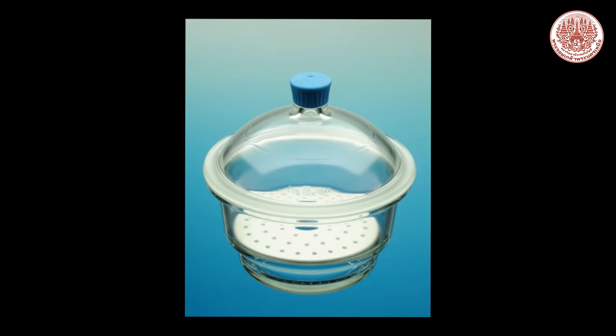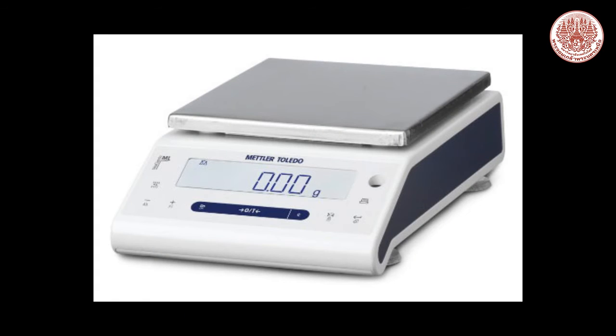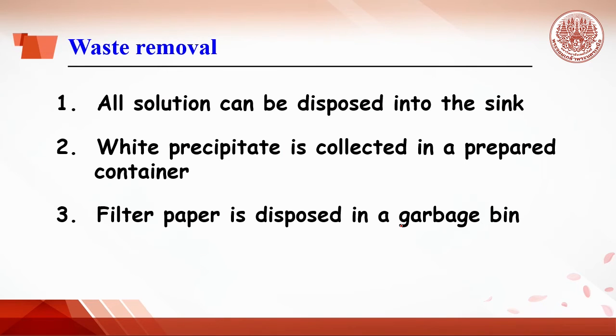Let the precipitate cool down and weigh the precipitate with the filter paper and watch glass. All the solution can be disposed of in the sink. The white precipitate is collected in a prepared container and the filter paper is disposed of in the garbage bin.